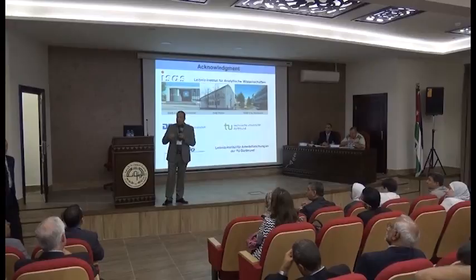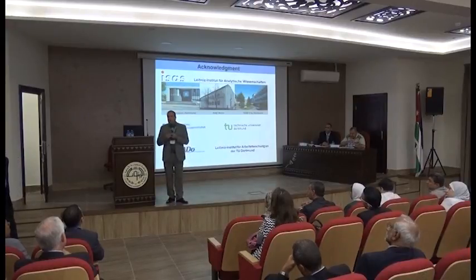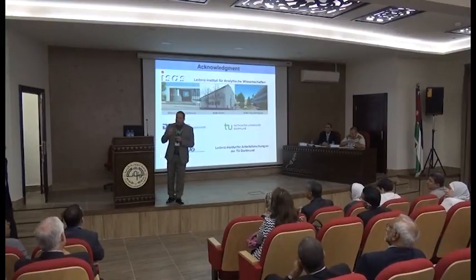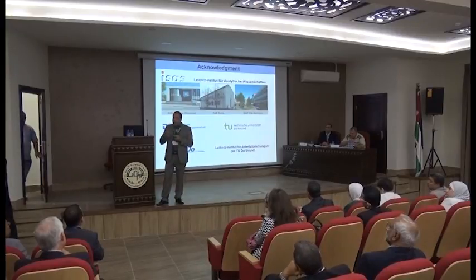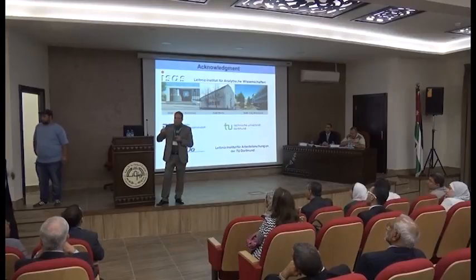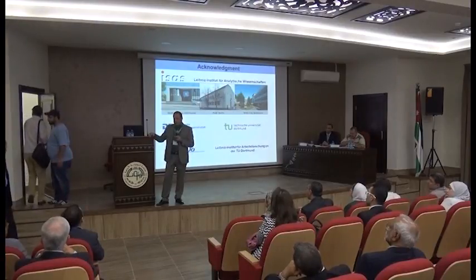So we are developing this in cooperation with a group on software. I don't know the name of the software, but we have the correlation. It's based on Bayes-based NMR. Then we can have information about the cancer state of this human or this patient.